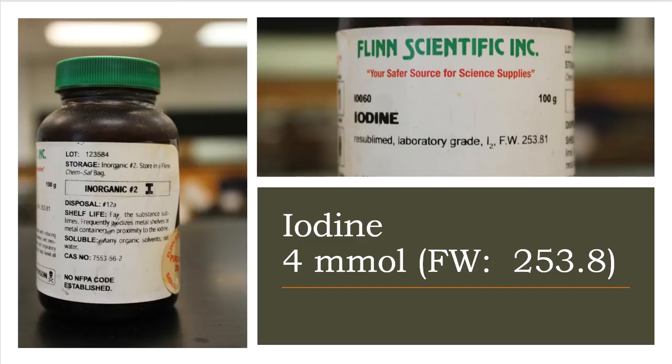First up, we need some iodine. If I follow the lab directions, it's going to tell me to weigh out 4 millimoles of iodine. Okay, well, why didn't they just tell me grams? Because they want you to do the calculation. That's why. So let's figure out how to do this calculation for those of you that might be a little bit rusty with this information.